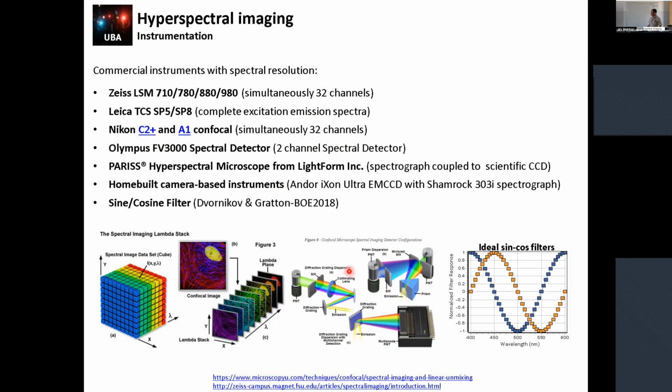Well, we can basically have an optical device that will open up the fluorescence, right? So this can be a grating or a prism that will discriminate between all the colors. And then we can have either a single detector or an array, and we can collect point by point or all the points together in a single shot.